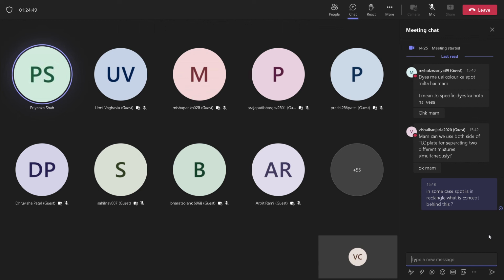ओके, आपको समझ में आया मैंने क्या बताया आपको? हाँ मैम. एक और क्वेश्चन है कि इन सम केस स्पॉट इज इन रेक्टेंगल, so what is the concept behind it? See, ideally, rectangle mainly in HPTLC, you will get.